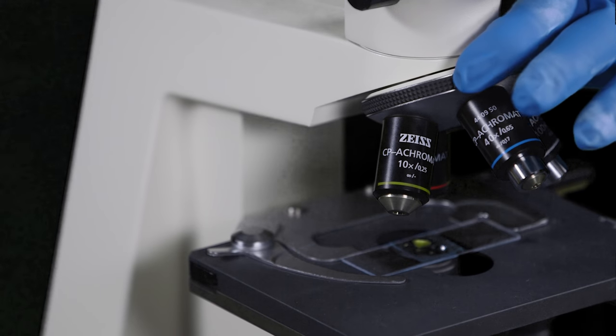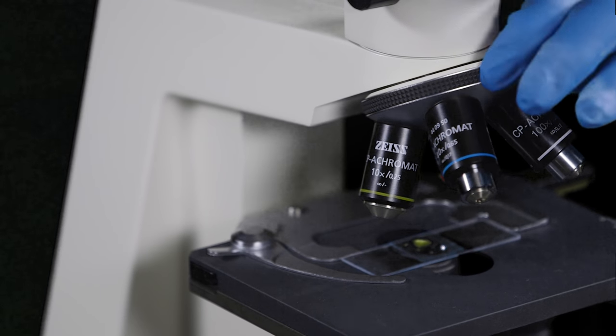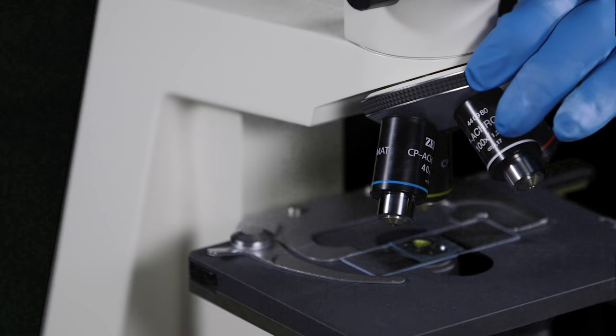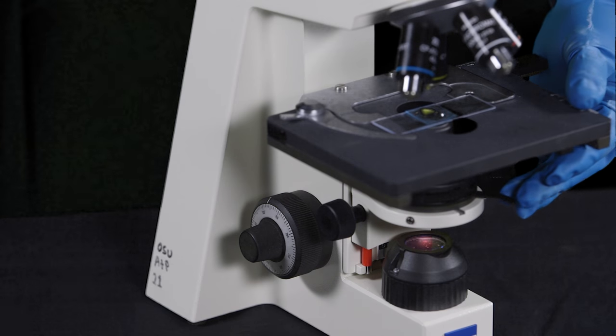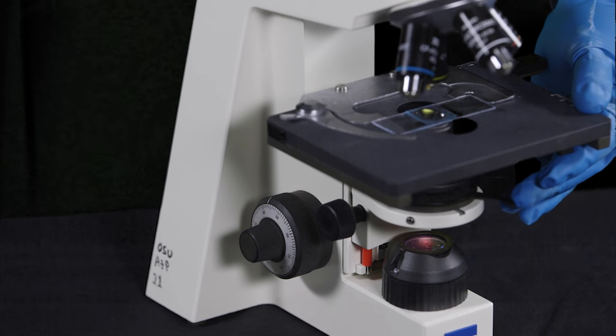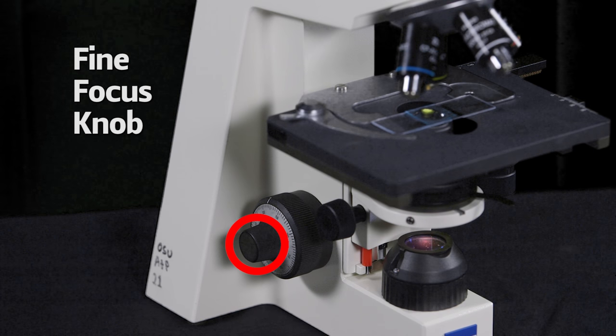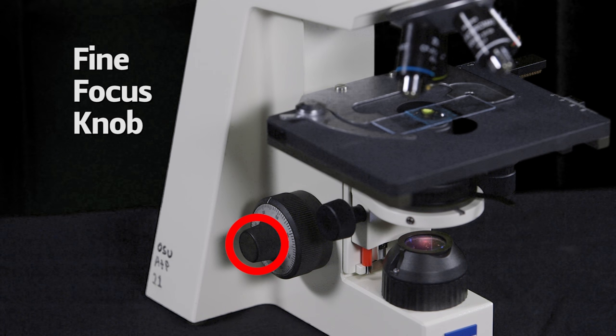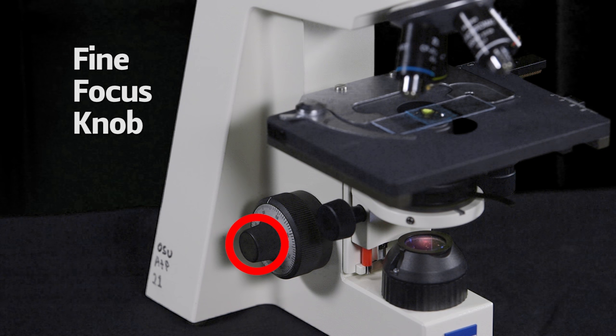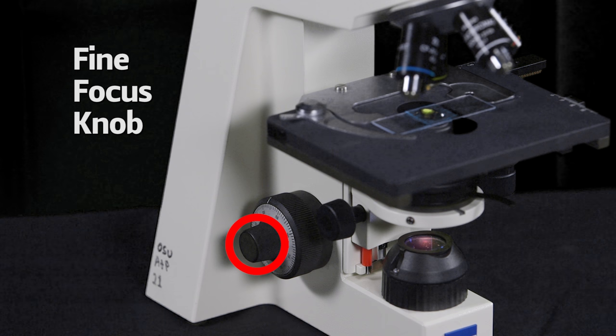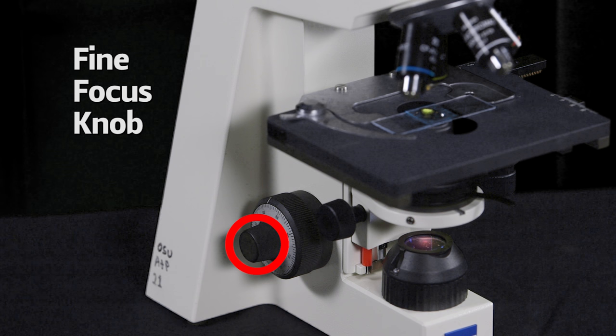When the specimen is centered and in focus, rotate the turret so that the next highest magnification clicks into place. From this point on, you will only be using the fine focus knob. Using the course focus knob could easily drive your slide into the objective and damage both the slide and the scope.